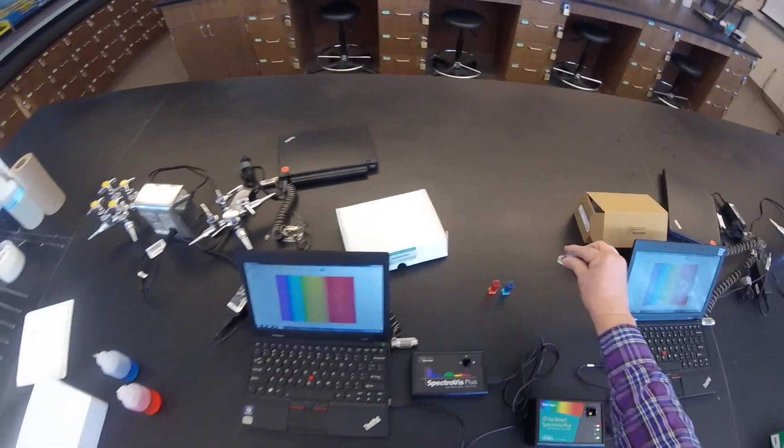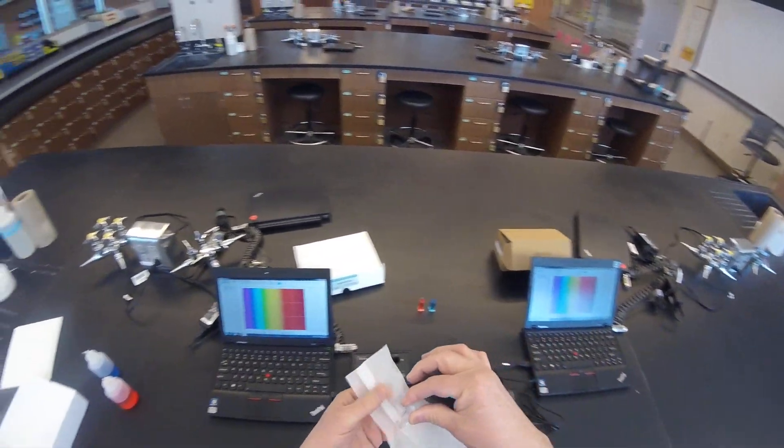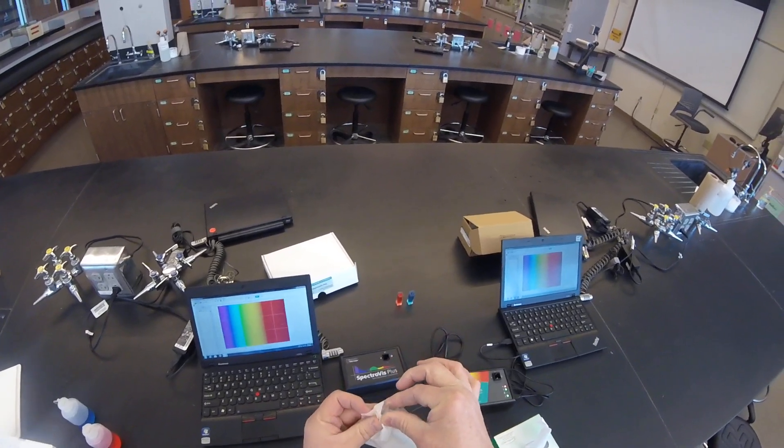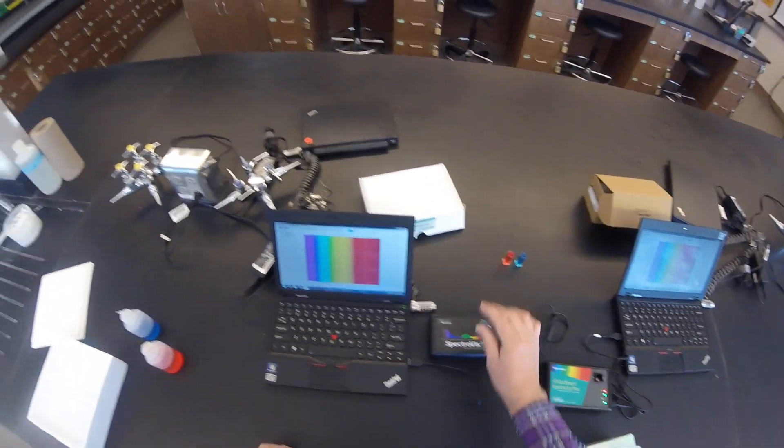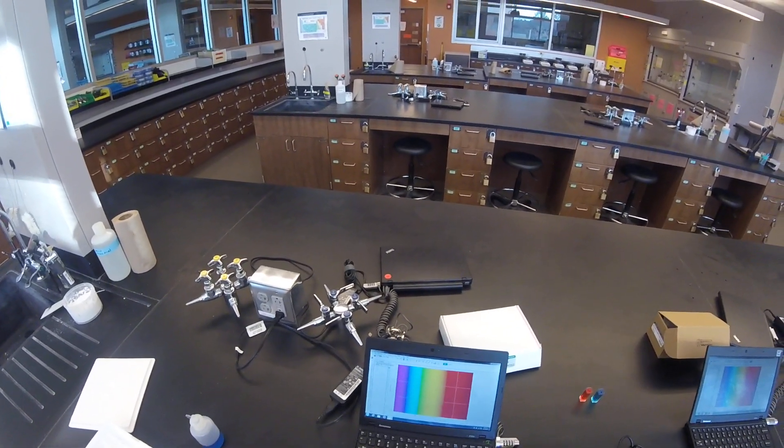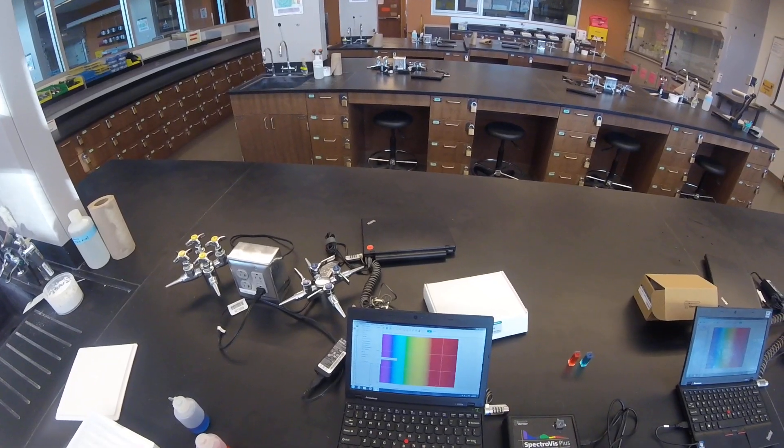You'll want to take yourself a cuvette with your blank. In my case, the blank is distilled water, because that's what I've got my blue and red dye dissolved in. We'll go ahead and go over here to the experiment. Click on Calibrate Spectrometer.